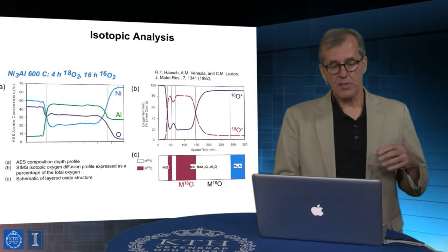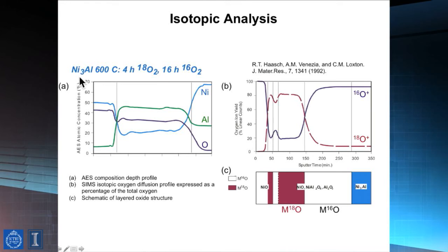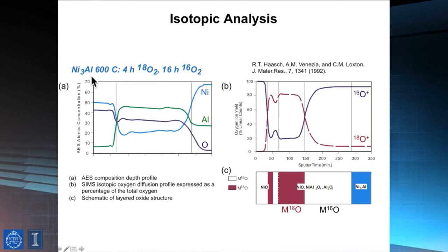So this is an example of what's called a superalloy, nickel-3 aluminum. It's one of these really high performance, high temperature resistant materials. Because of the high nickel content, very useful in oxidizing ambients.